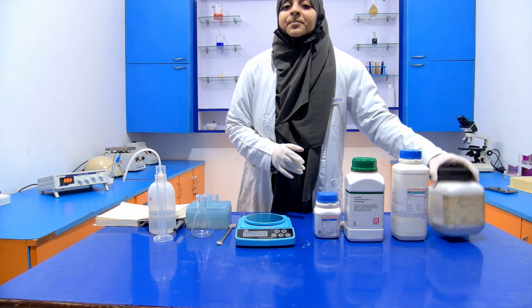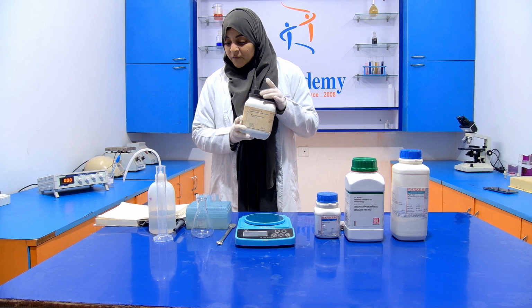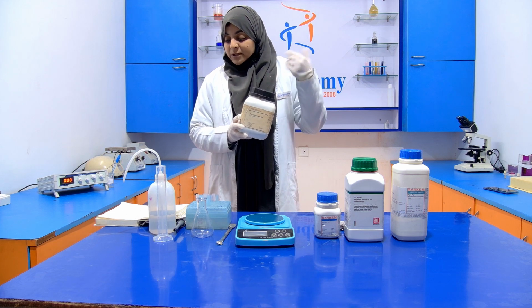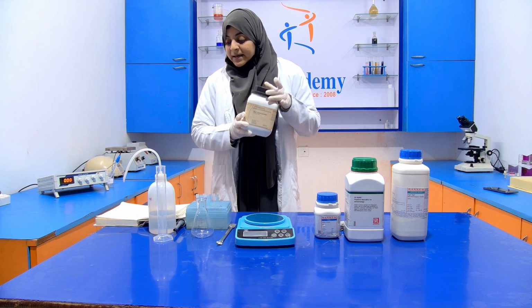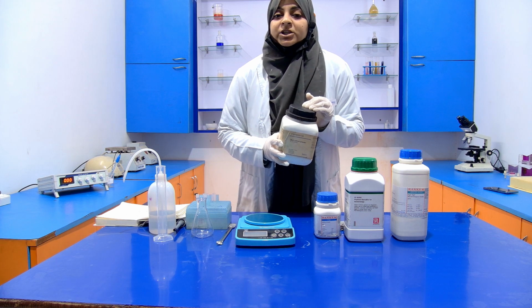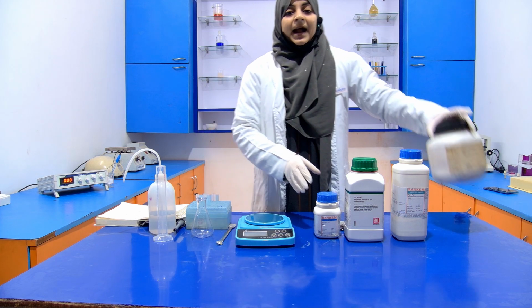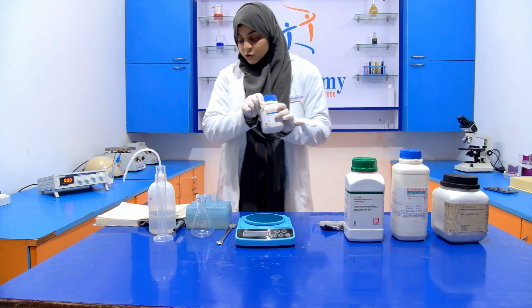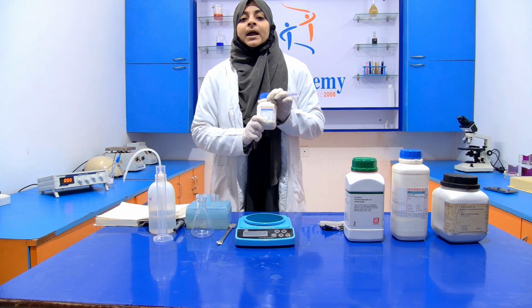Then beef extract is used as a source of many water soluble nutrients like vitamins, carbohydrates, nitrogen compounds, and different salts, which are very essential for the growth of the microorganism. And at last, we require sodium chloride, which is used to maintain the osmotic pressure.